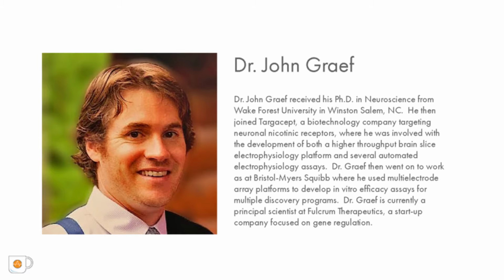Thank you, Melissa, for that introduction. What I would like to talk about for this webinar is how at Fulcrum we are using patient iPSC-derived neurons and Axion's multi-electrode array platform to elucidate a functional phenotype for Fragile X neurons, and how we went about correcting that phenotype by restoring levels of FMRP, the deficient protein underlying this neurodevelopmental disorder.